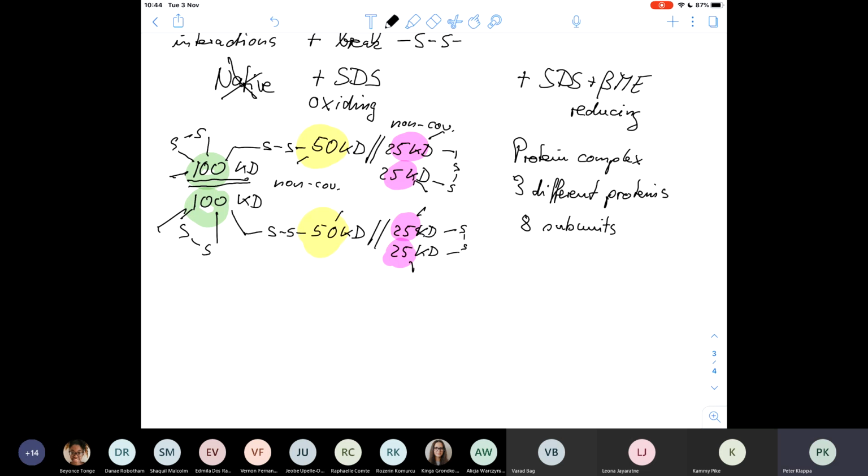Does that make sense so far, what I have done? Yeah? So you can follow. Now, big question. What is the molecular mass? And you know what kilodalton means. It means just 1,000. What is the molecular mass of this complex?